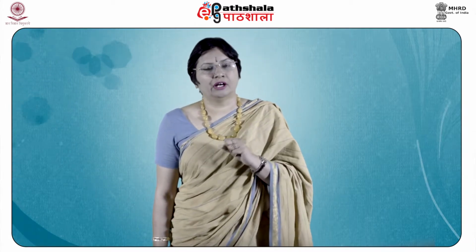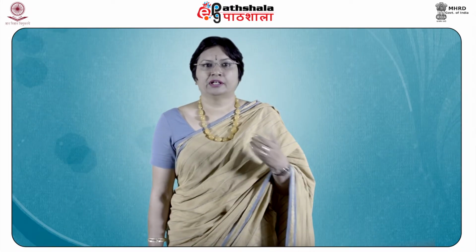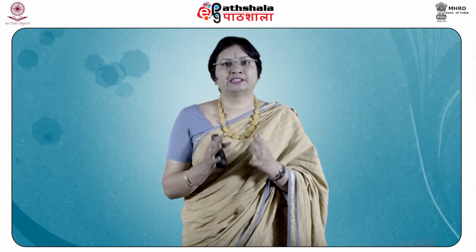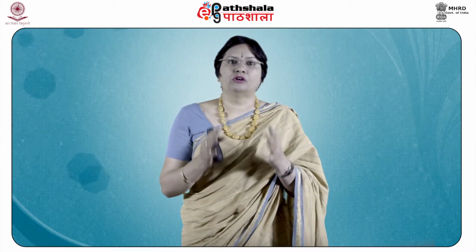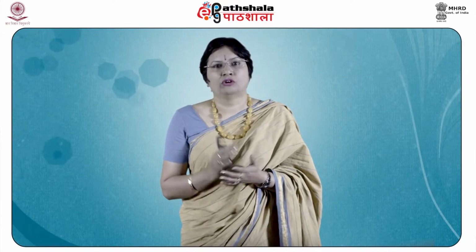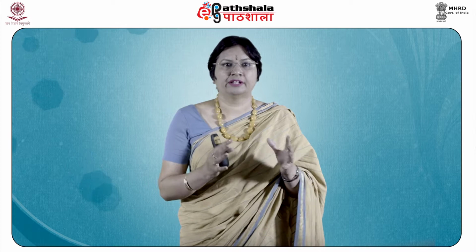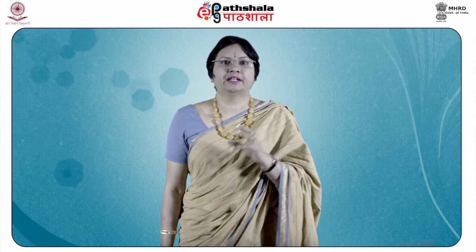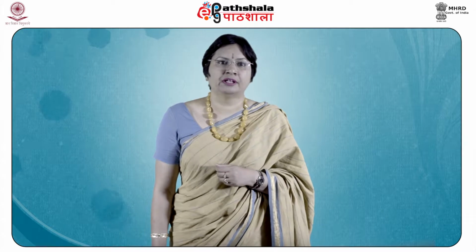And we will also see how the flame test for sodium, potassium, barium, calcium and strontium can be done. In addition, we will do some chemical tests for inorganic anions making their pyridine extract, and there comes the sulfur, and then we will also see how the TLC of cations can be done. We will also see how the chemical test for some anions in pyridine extract, like sulfur, can be done, and how the thin layer chromatography of some cations like aluminium, zinc, arsenic, barium, mercury and lead can be done.